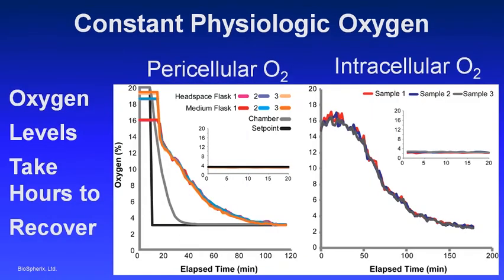But it doesn't take that long. You say it's just a quick medium change, then they're right back in the incubator. These are things I hear from people all the time. It doesn't matter. But actually, if you look at how long it takes those cells to return to the right oxygen level after they're put back in a low oxygen incubator, you can see that there's lots of time for the cells to be affected by this.